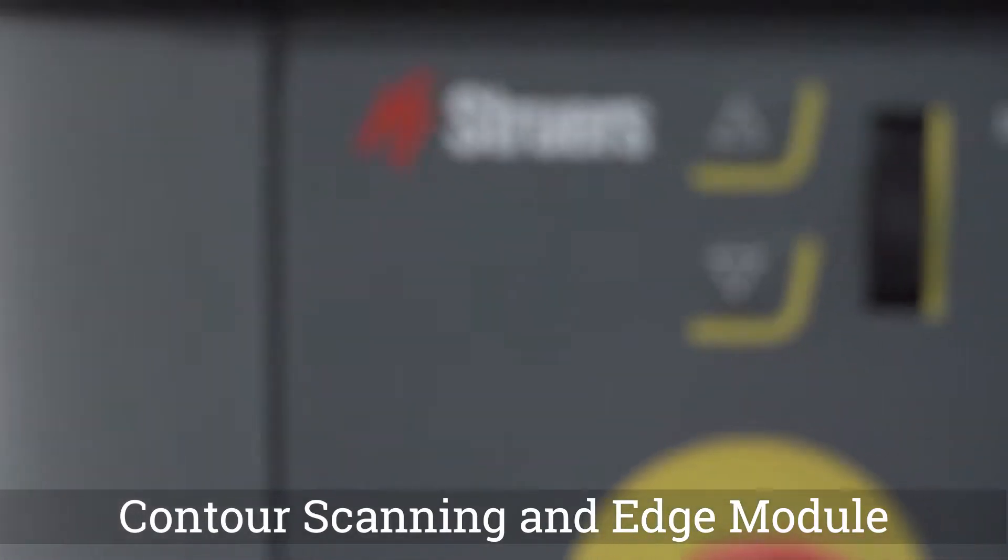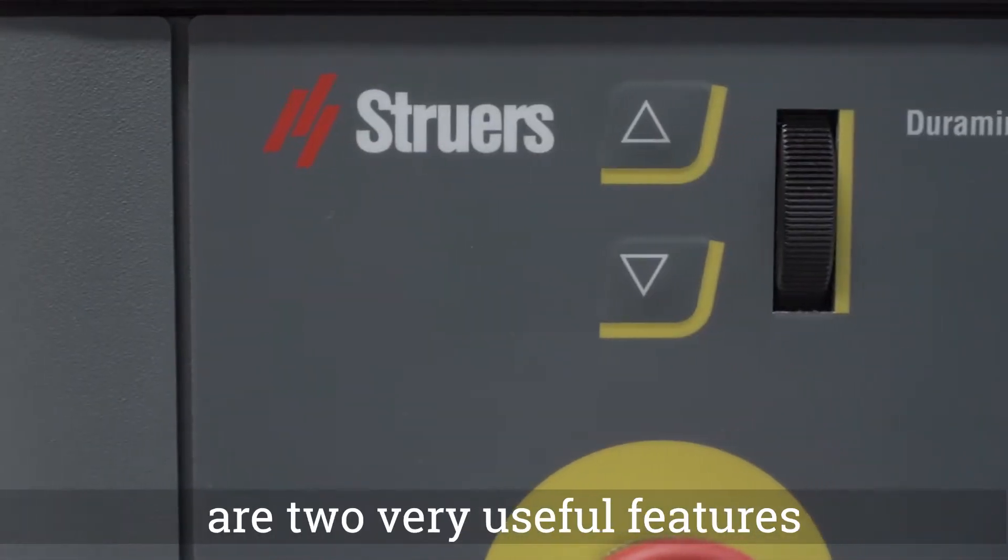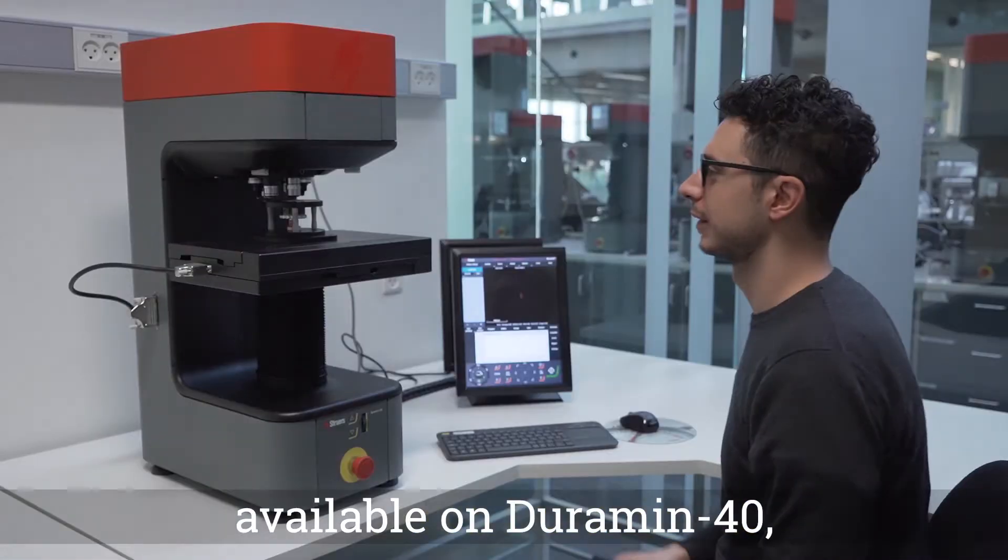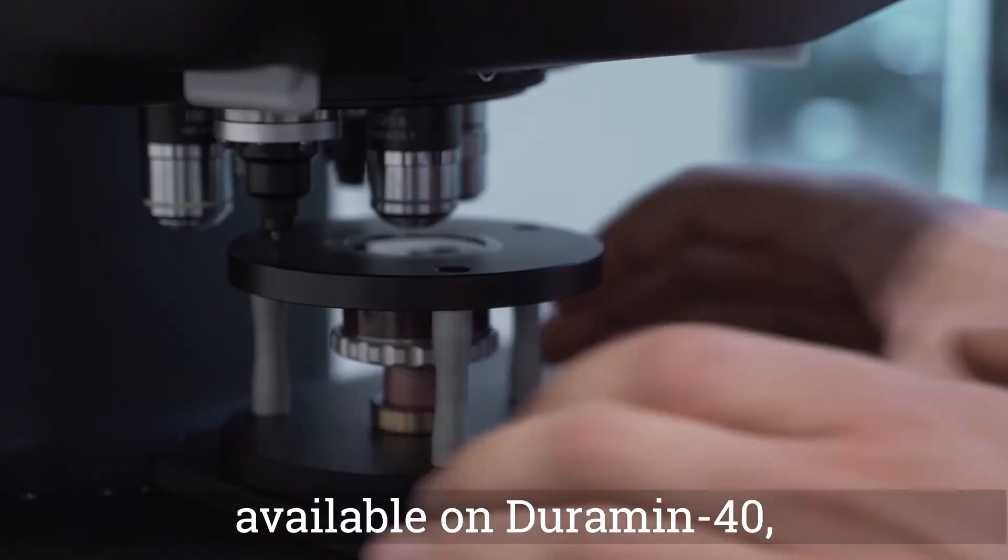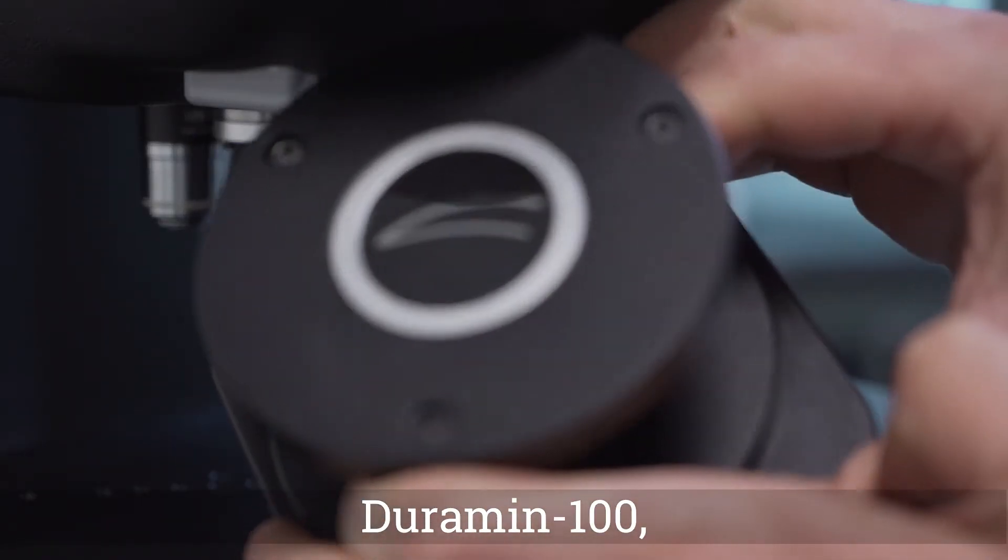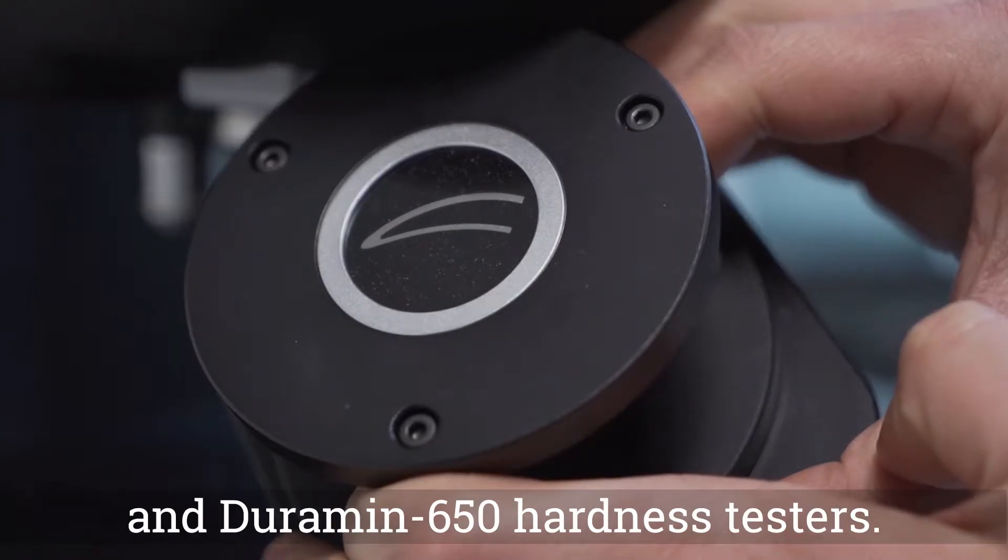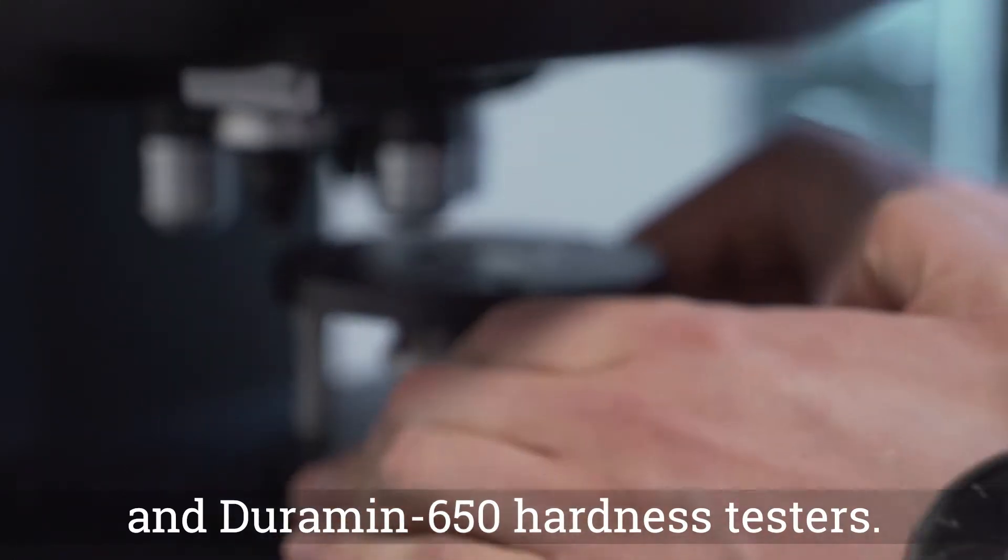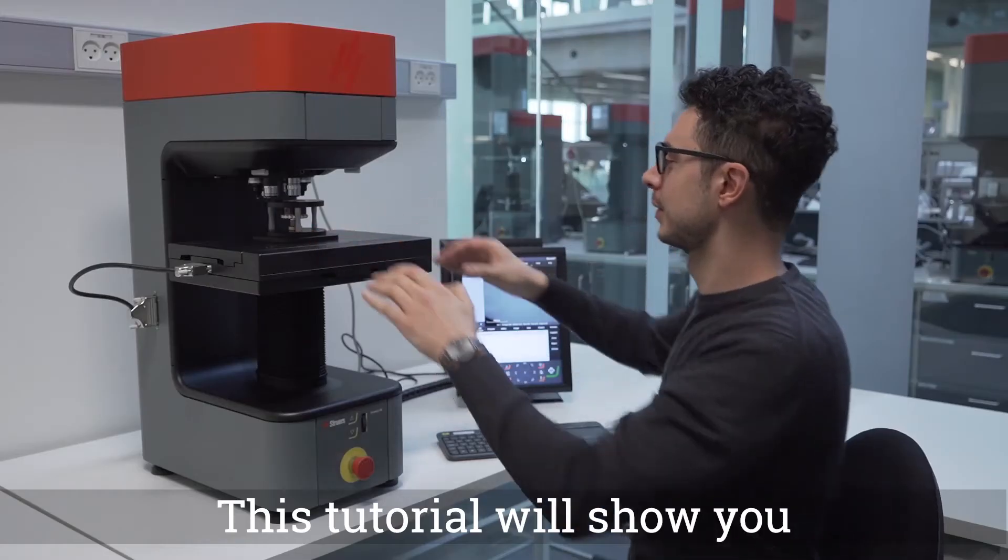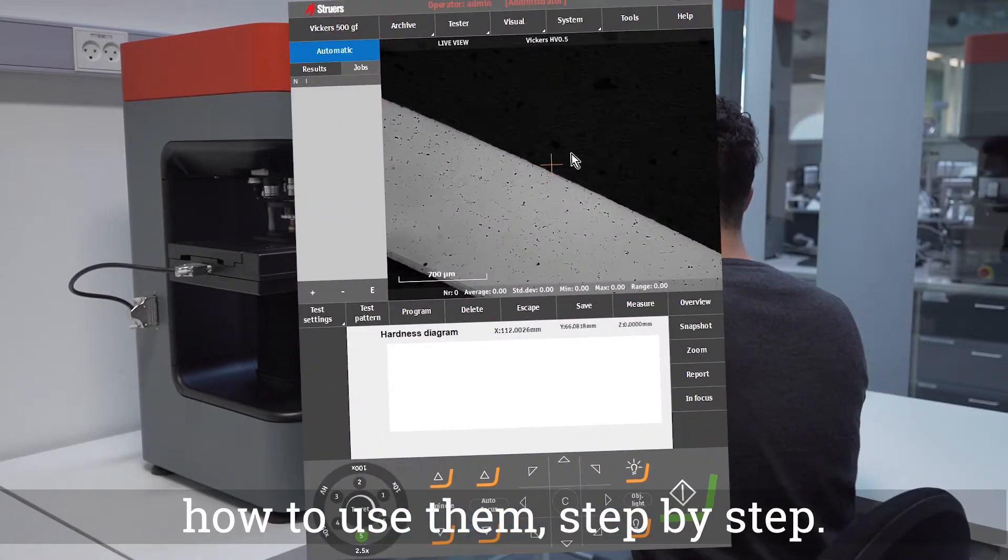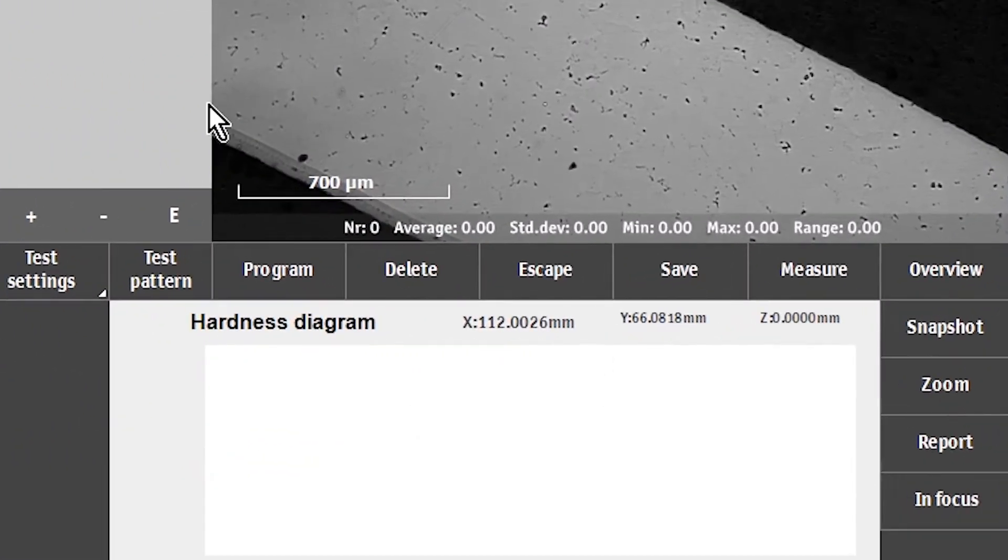Contour scanning and Edge module are two very useful features available on Duramin 40, Duramin 100, and Duramin 650 hardness testers. This tutorial will show you how to use them step by step.